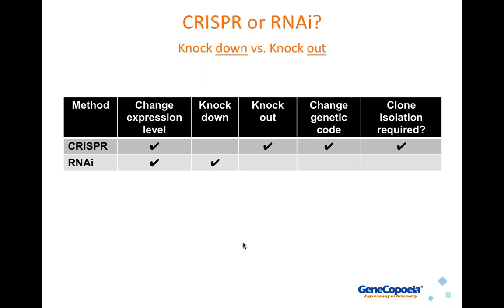And then RNA interference came along, which made the process much easier. And a lot of people are familiar with the process of knocking genes down using RNAi. Well, CRISPR can be used for gene ablation experiments as well, and this is very relevant to today's talk, but there are some fundamental differences between the two approaches that are very important to keep in mind when doing your screening work and designing your experiments.